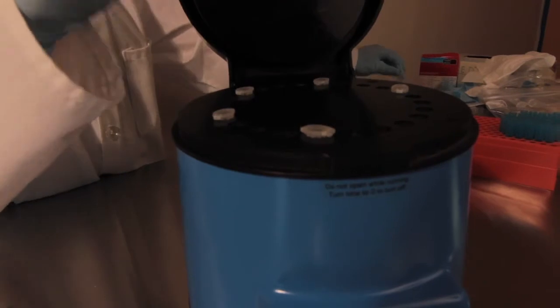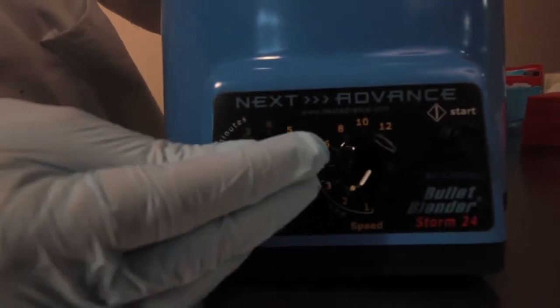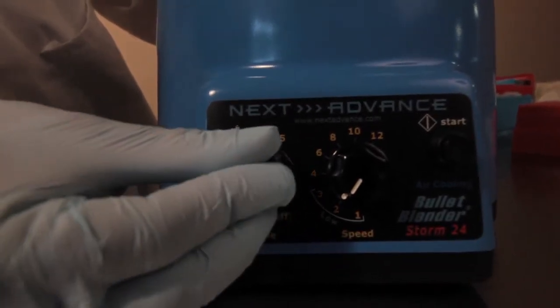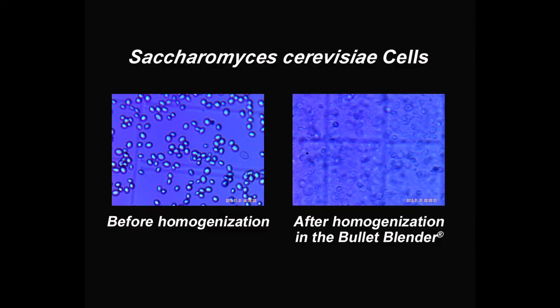Examine your samples. If homogenization appears to be incomplete, or if your results show that cell lysis is unsatisfactory, place them back in the Bullet Blender and homogenize for another minute or two at speed 10. Now, it's time to proceed with your downstream application.